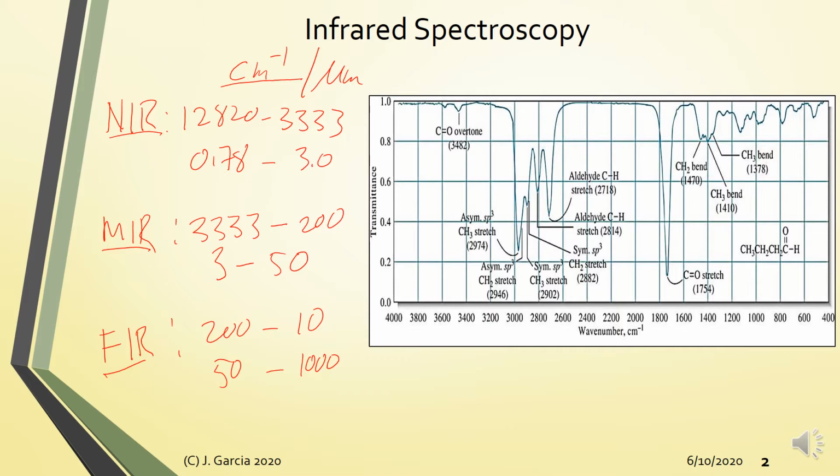Now in organic chemistry, this particular spectra, for example, focuses on mid-infrared spectroscopy. The application of near IR is more quantitative. Although we will not be discussing this in full detail, our discussion will focus more on mid-IR spectroscopy. Their principle is the same; all of these are vibrational spectroscopy.